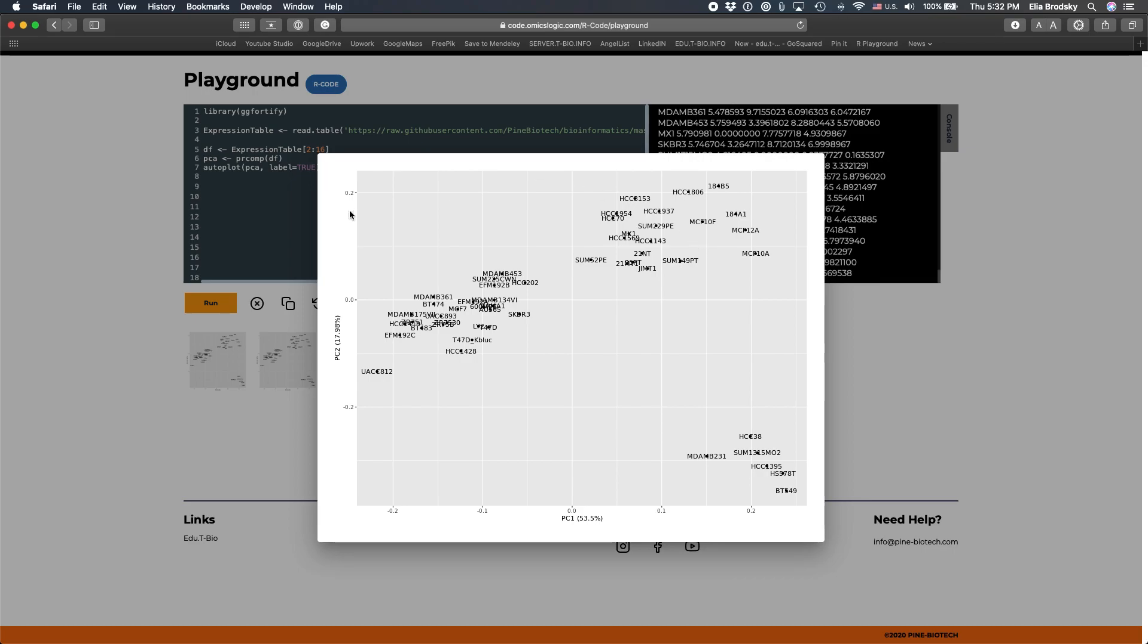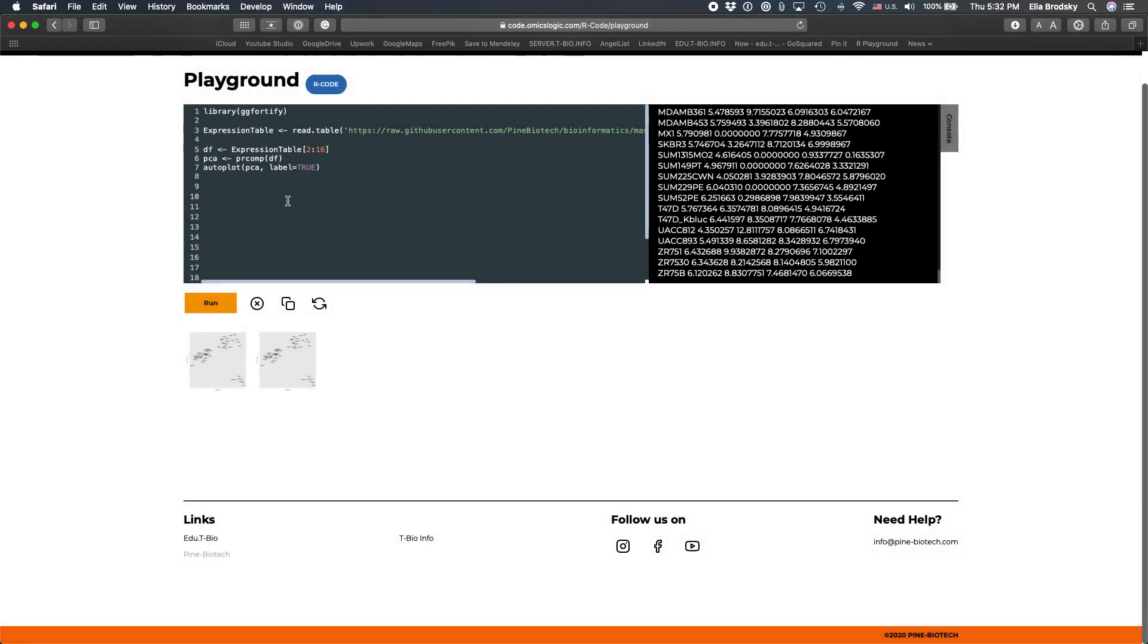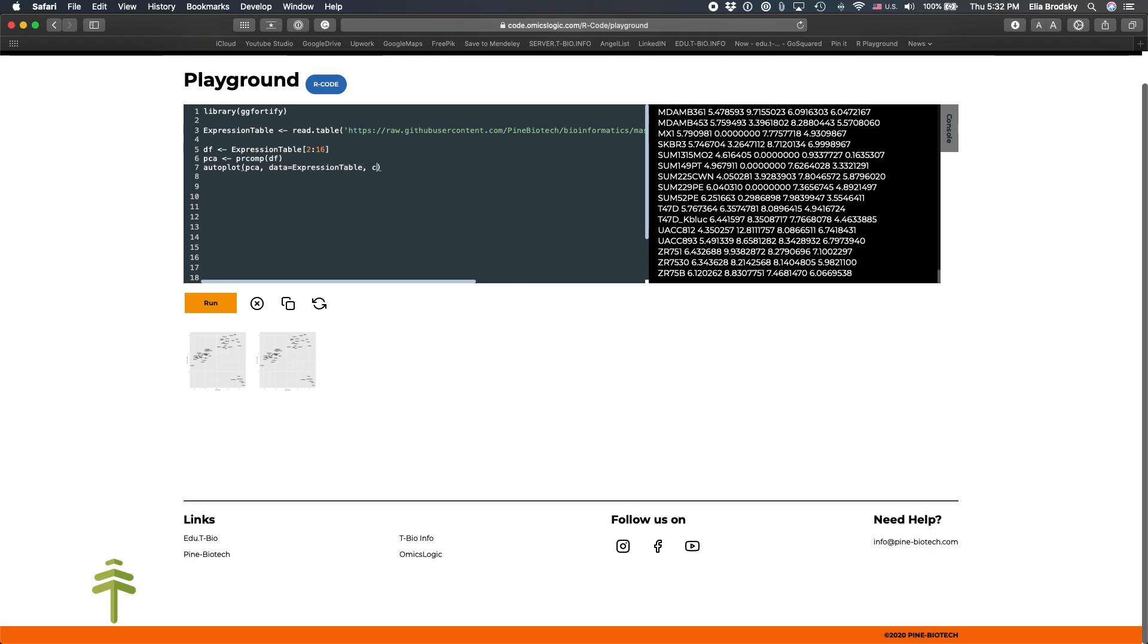But it's not very useful because what we want to do is we want to know the color by group. So let's delete this. And instead, we'll say that we'll use the data that we originally loaded, expression table. And we'll take from here one of the columns that is called group to label our data.